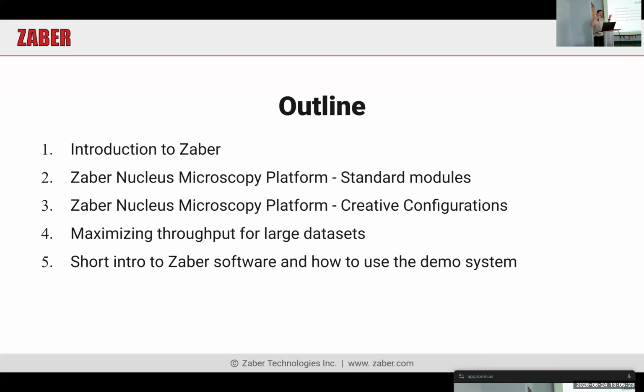And then I want to take a few minutes to look at some of the foundations of the high throughput side of automated microscopy, and think about where and how it makes sense to optimize. I am also leaving an instrument here for a few weeks. So we'll do a crash course in how to actually use that instrument, so that if you want to try something out and have a go, you've already got what you need to get started there.